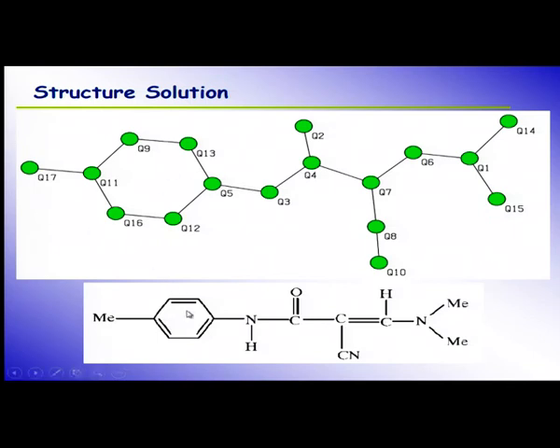If you look at the structure given by a chemist, I have this ring, the methyl group carbon is here, a nitrogen, X, hydrogen I will fix later, carbon, oxygen here, fine, CN is here, then CN, CH3. So, by looking at the figure, you can identify among the Q which species are carbon, which are nitrogen, which are oxygens. Even if the chemist does not give me a picture, by looking at the bond length, C double bond O will be shorter than C single bond C. We can guess whether it is a double bond or single bond, whether it is nitrogen or oxygen. You can get an answer.